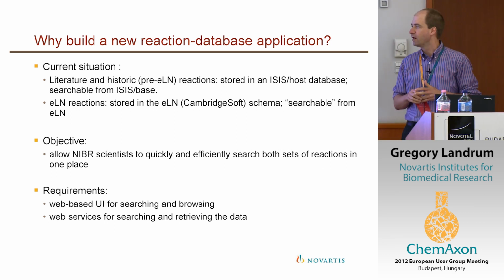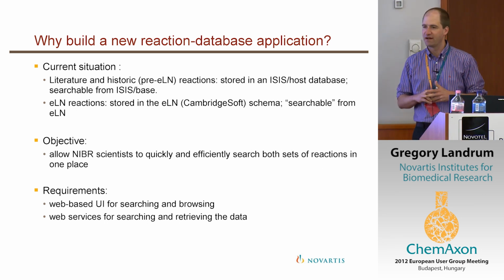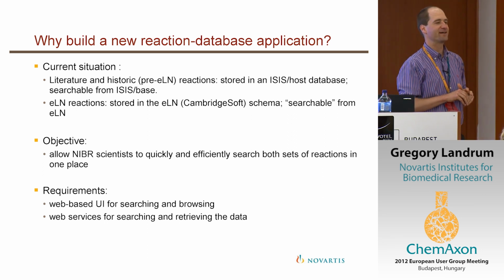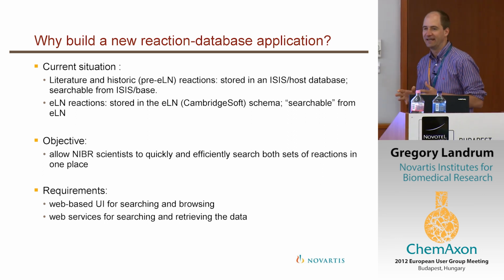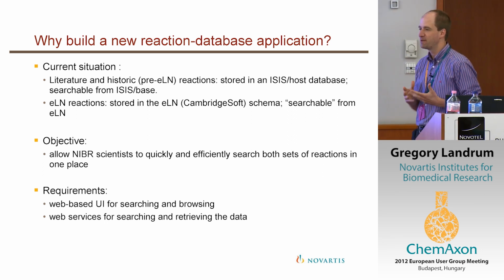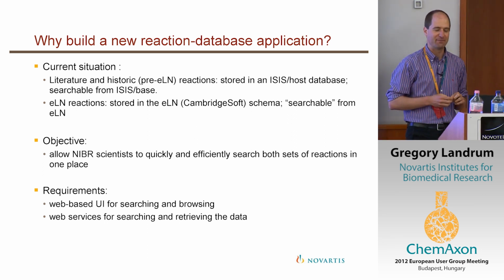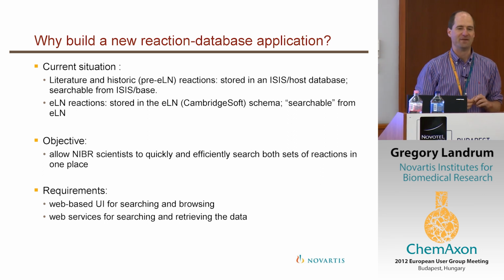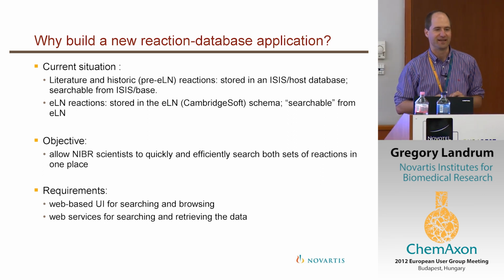For those of you who have worked with this ELN, one of the downsides, or let me start with the positive part. One of the positive parts is it has a very flexible database schema. So you can put anything in it, which is great for them and it's great for people working with them. The downside of that highly flexible database schema is that searching is not really very good on it. It takes a long time to do a substructure search across our ELN database.